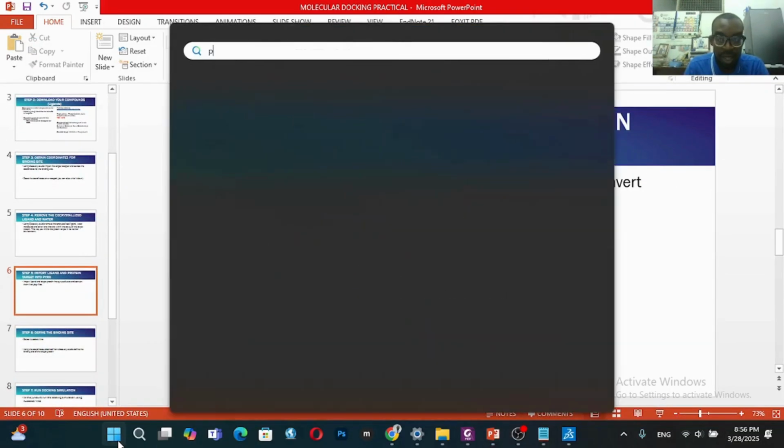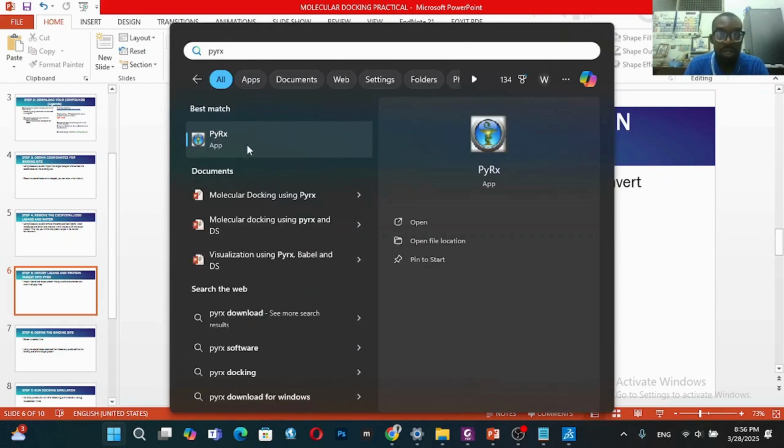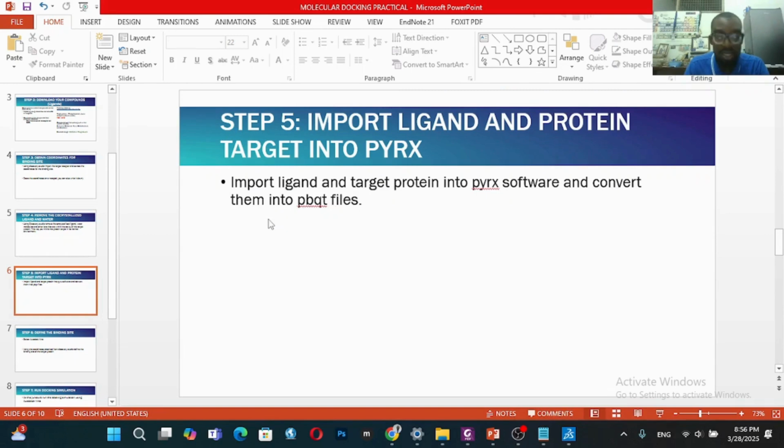Now I'm taking this step by step because I want every one of us to be able to do the same. If you encounter any issue while doing this work, please, you can always get across to me. So we are opening PyRx. We've clicked on it. So let's wait for PyRx to come up.